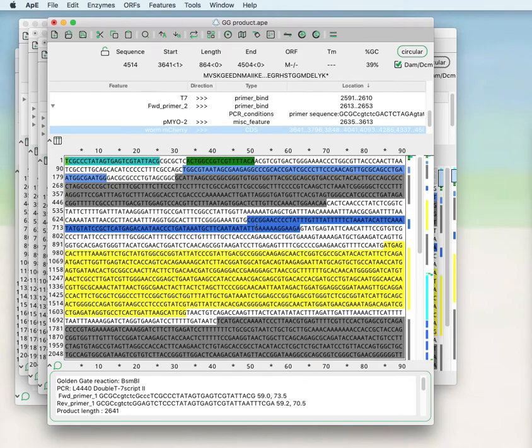Welcome to the APE tutorial video series, video number 10. This video will cover various translation and mutagenesis tools.